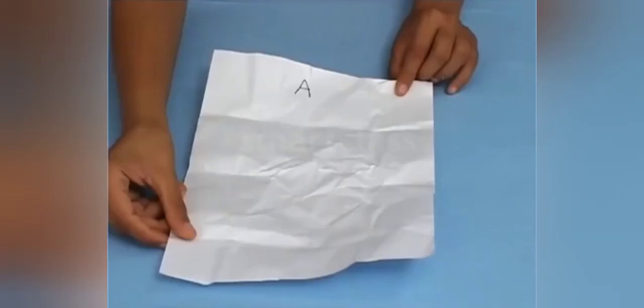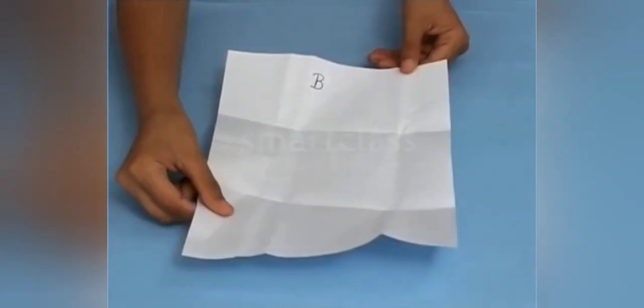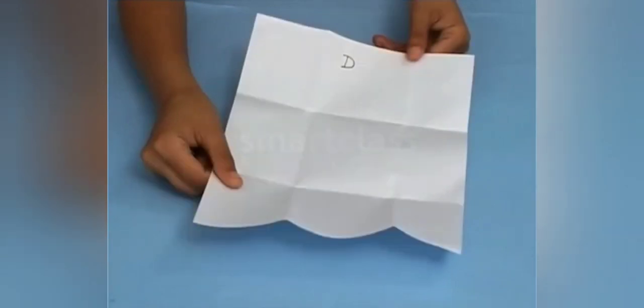What do you observe on the paper pieces? Let us see. There is nothing on paper A and paper B. There are some peculiar patches on paper C. No, there is nothing on paper D also. Let us find out more about the patches on paper C.